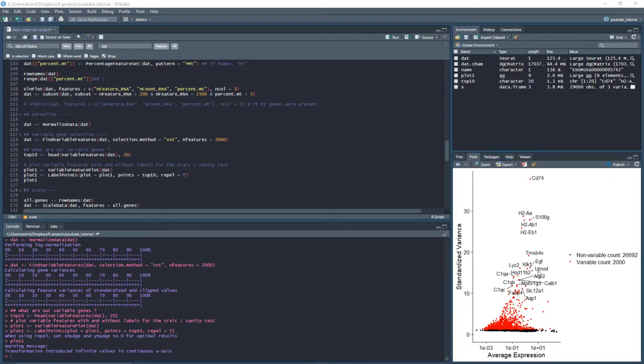Similarly, things like UMOD, which mark particular tubular cells, and aquaporins, these are all very, very characteristic of certain cell types. They all are, actually. So it makes sense that they'd be very high in one and down in another, hence the higher variance.